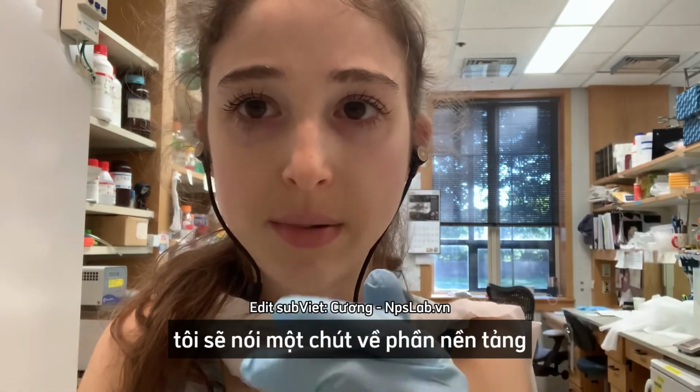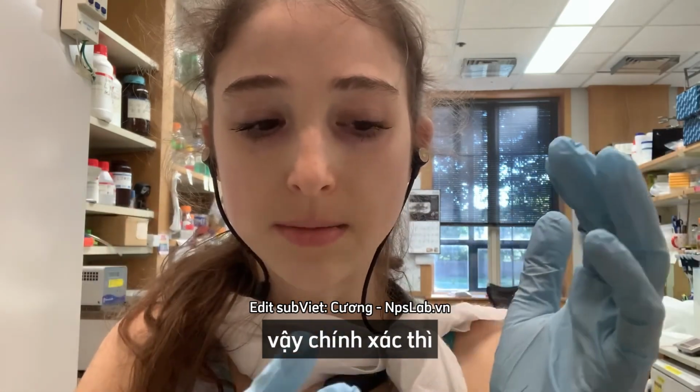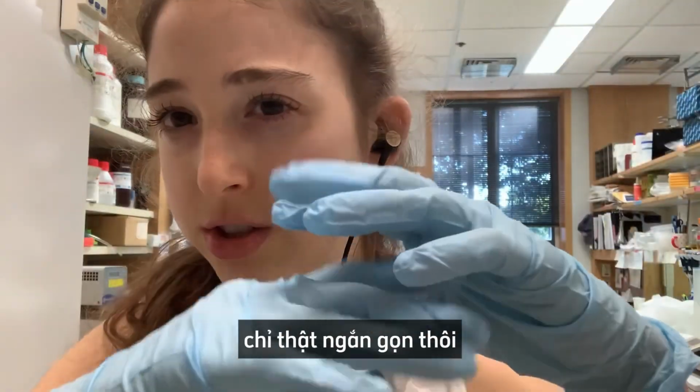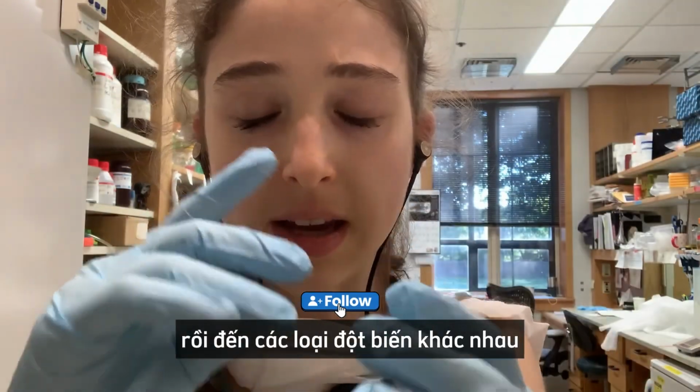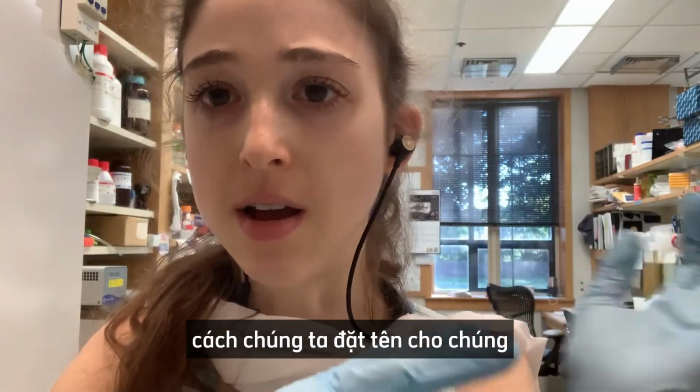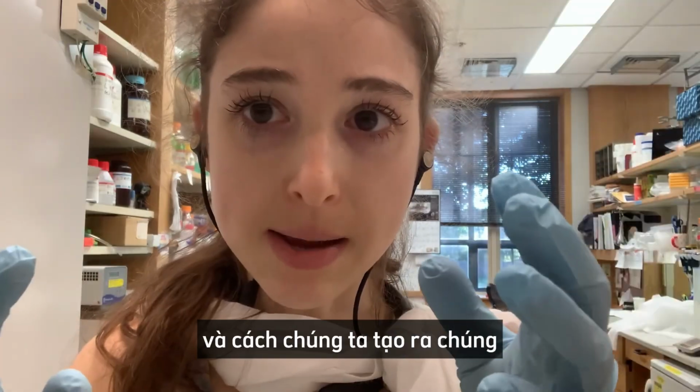I'll talk a little bit about the background. Starting with recombinant expression, just a really brief overview, then different types of mutations, how we name these, and then how we make them.